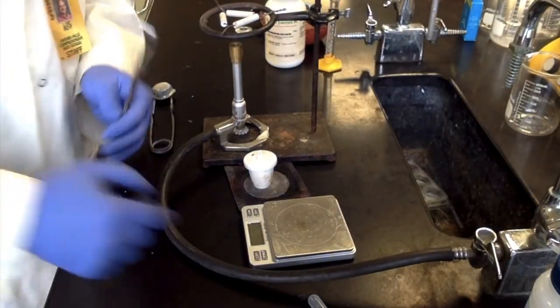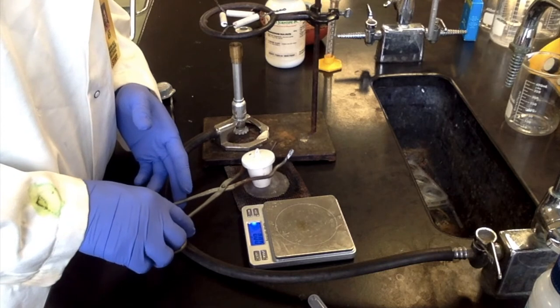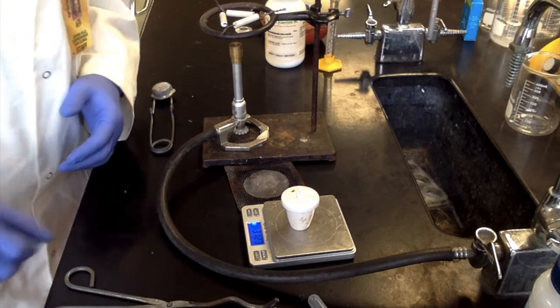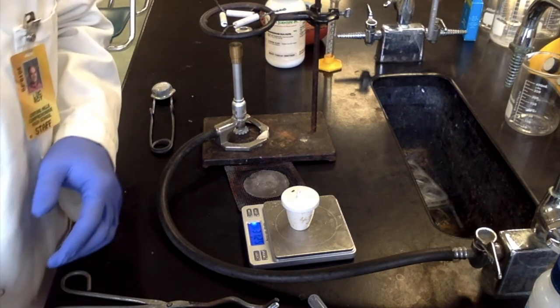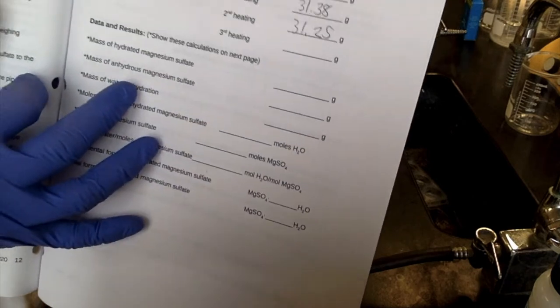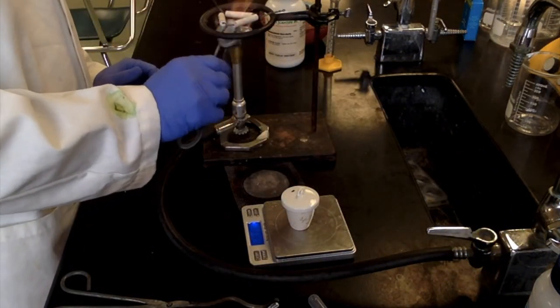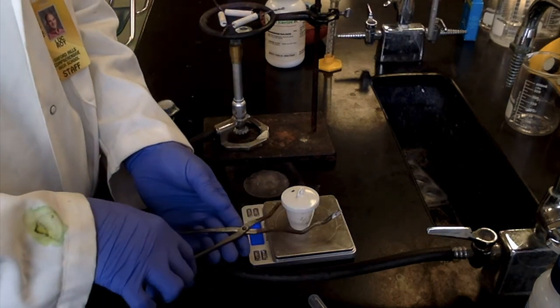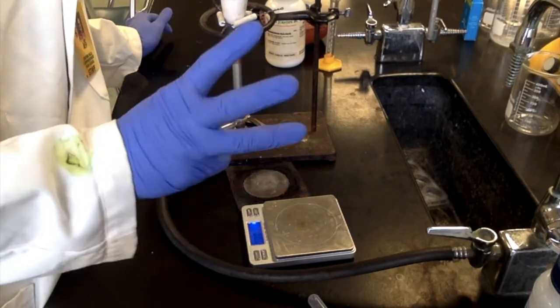All right. So it's been five minutes of it cooling after the second heating. Let's get a mass measurement. All right. Scale zeroed out. Carefully pick this up. So we're at 31.23. Oh, it's changing. 31.25. We had 31.38 before. So we will have to go for a third and final heating just to dry it out. So we'll get our Bunsen burner going again. And place our crucible in flame.